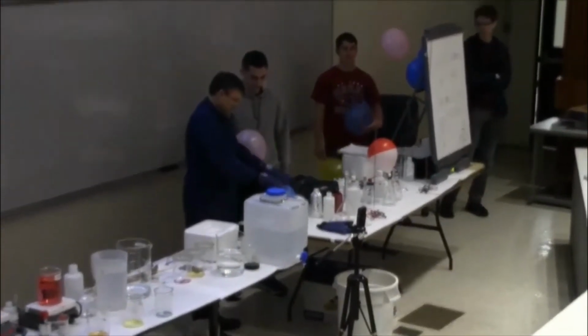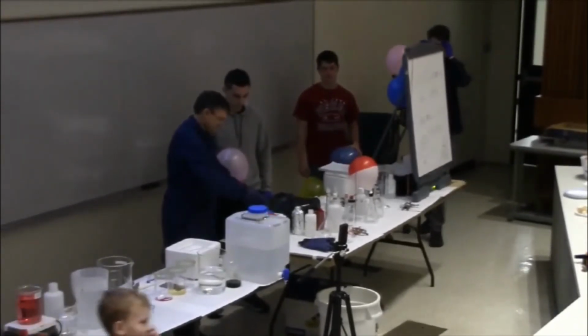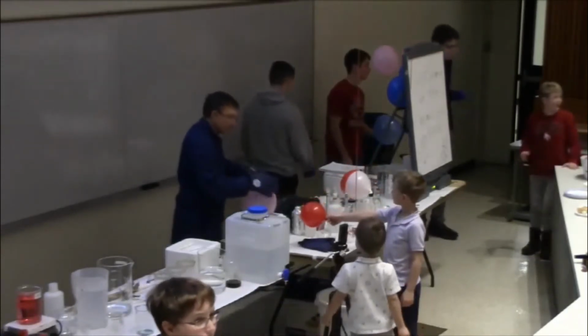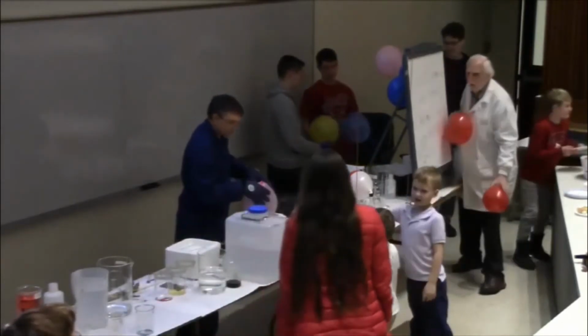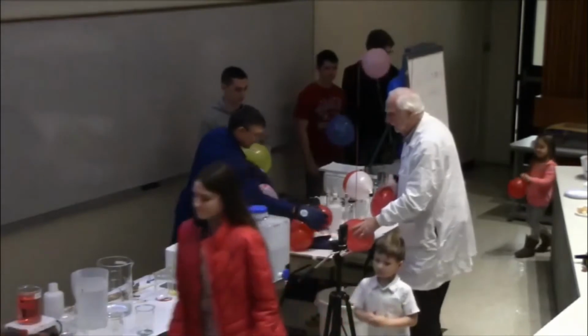Still waiting for this one to shrink. Just put it on the table. Good. And you put it on the table too. Thank you. Perfect.